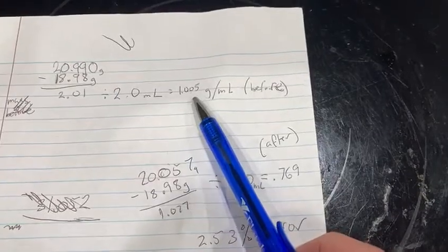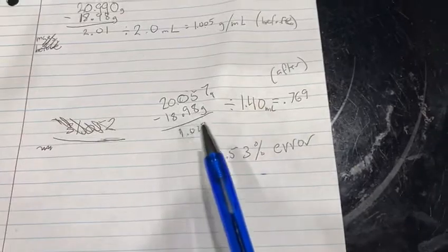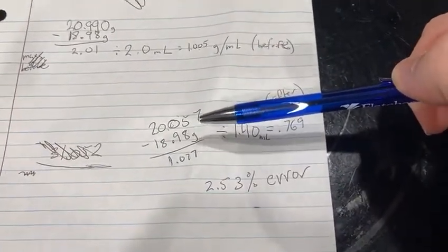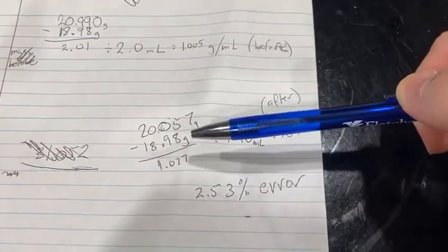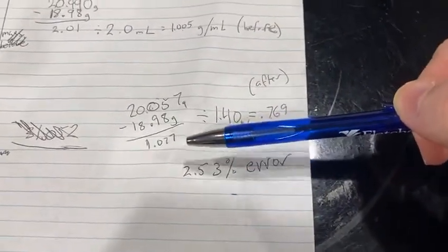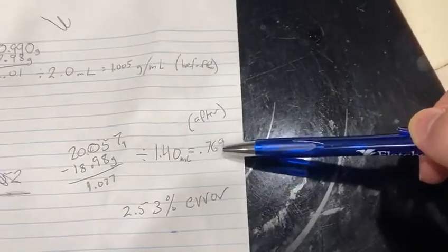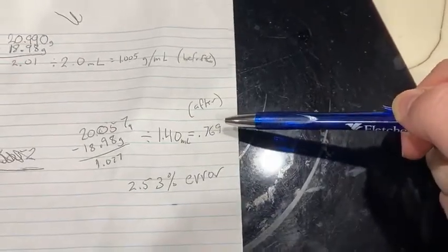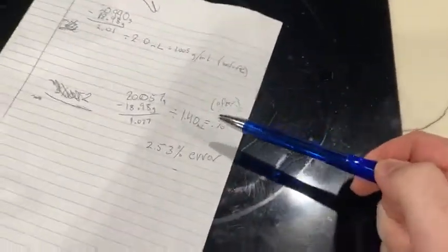With all the colors and other things added, the density inevitably goes higher than water. Now looking at after the distillation process — the graduated cylinder plus the liquid we collected, which was hopefully mostly ethanol, minus just the graduated cylinder, gives us the mass of the ethanol divided by how much ethanol we collected. Our measured density came out close to the actual density of ethanol, which is 0.789. There's inherent accuracy issues given how homemade this experiment is, but it was only 2.5% error — pretty solid.